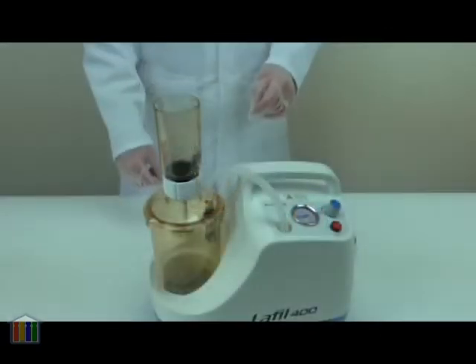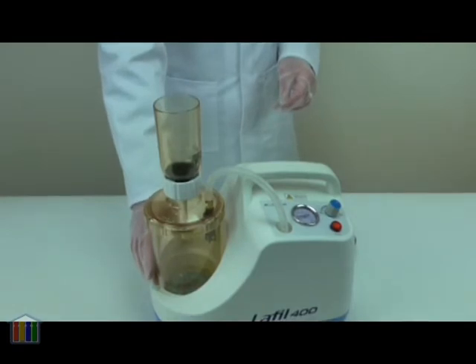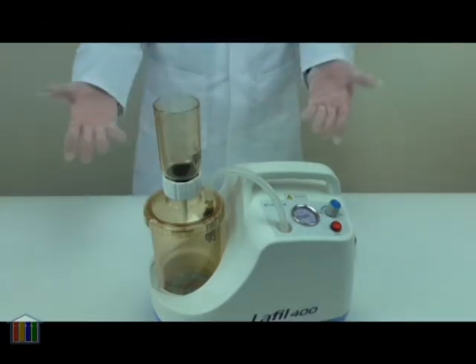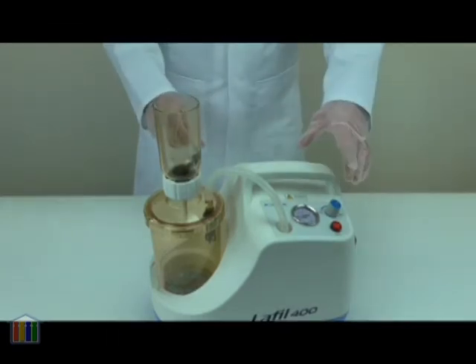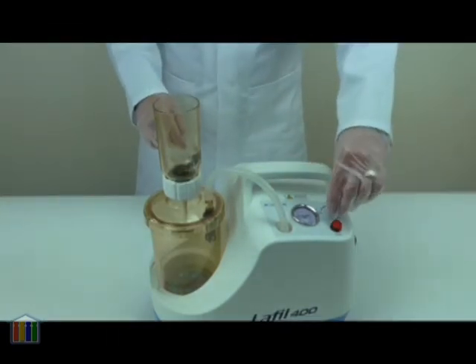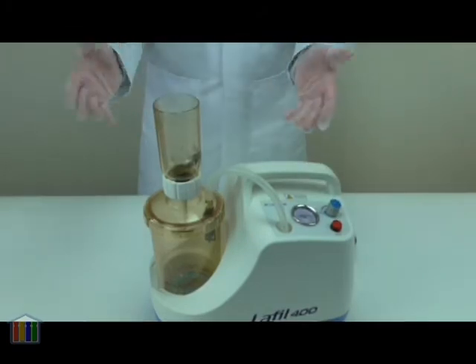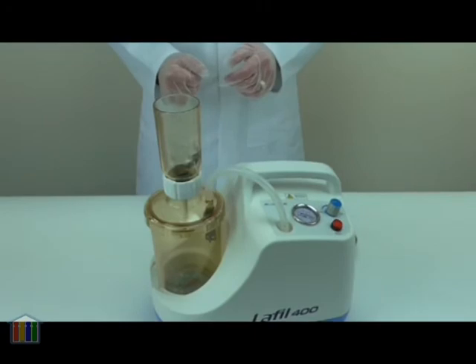As we reach the end of the sample you can see the clean filtrate in the reservoir at the bottom. The residue from the sample itself is left on the filter which you can either keep or discard as required. You can then switch off the system by pressing the button and releasing the vacuum by turning the knob to the low position. At this point you can disassemble everything and you have your clean filtered solution in the reservoir.